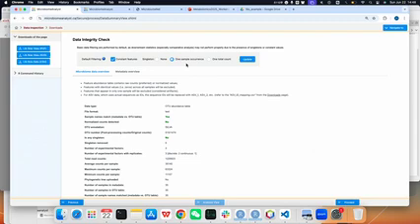So you can define the singleton you would like to study. For example, if you think in total it only has one count, so you remove that, it's also okay, you can choose that.